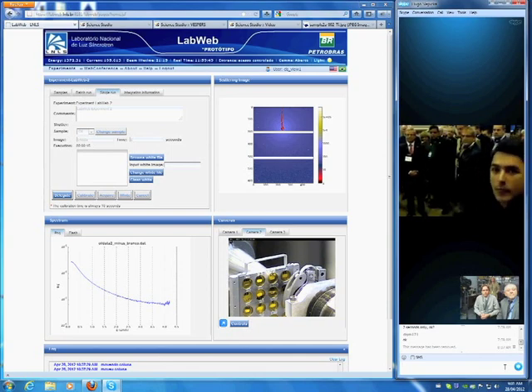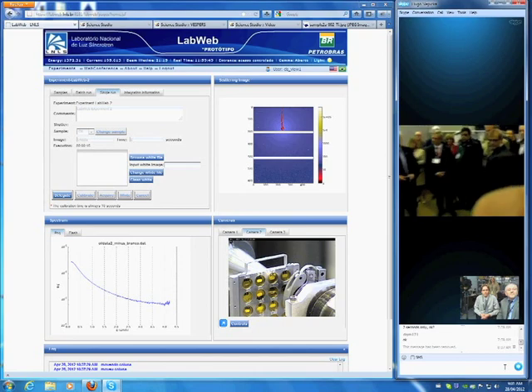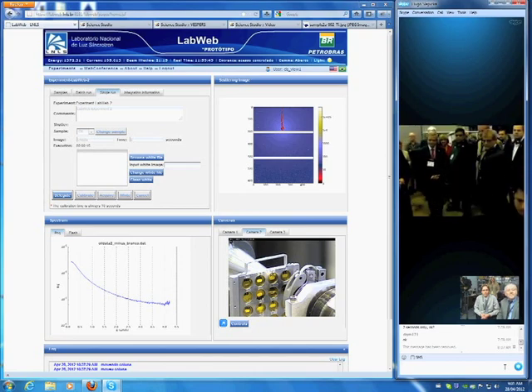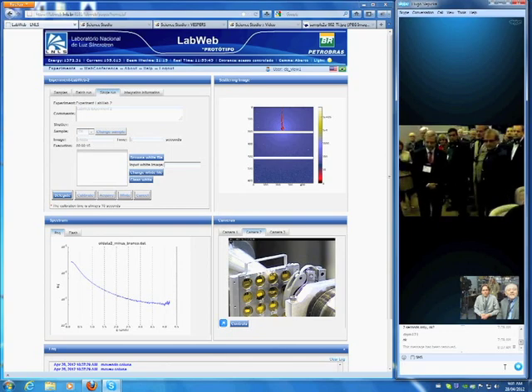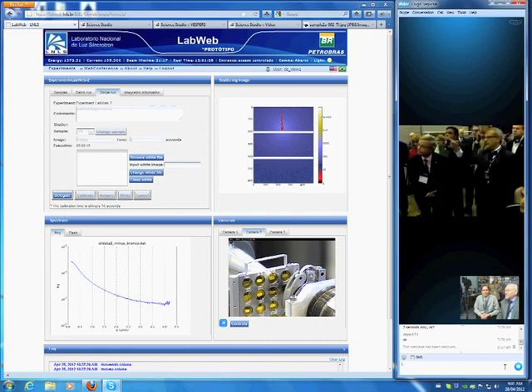What we do first, Lisandro, can you take control of the experiment? Yes, okay. This is the sample you're going to study? Yes. Here I am in theoretical physics and chemistry in La Plata, and I will do a measurement of a silicon oxide material. What I'm going to do is, you see on the screen there, choose which sample I will measure.